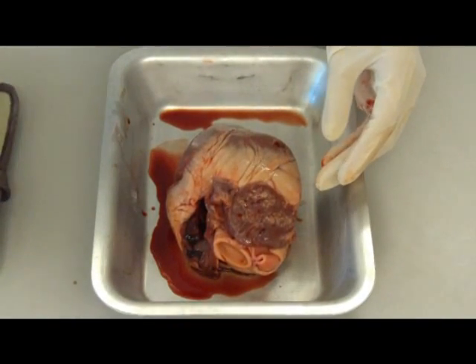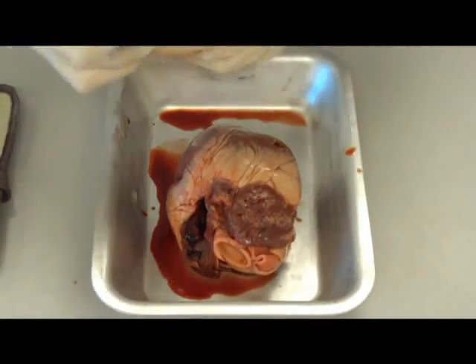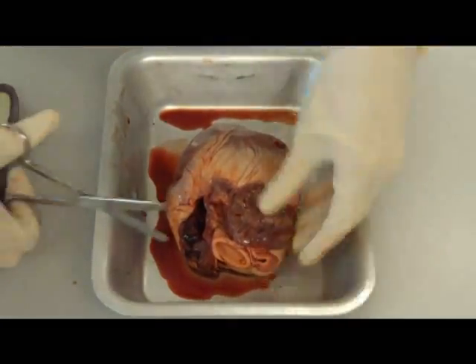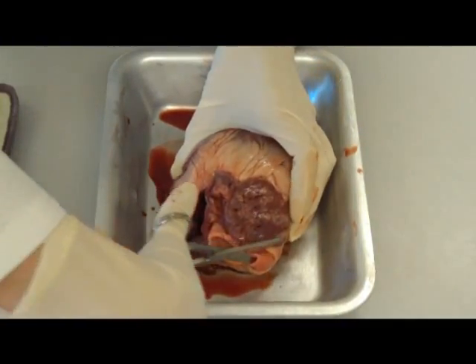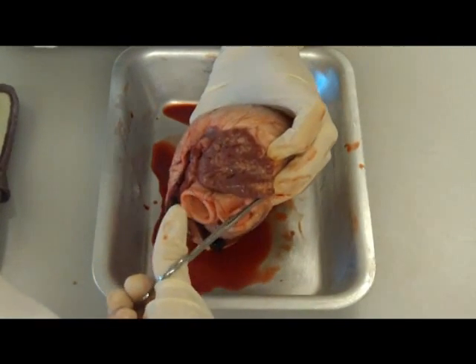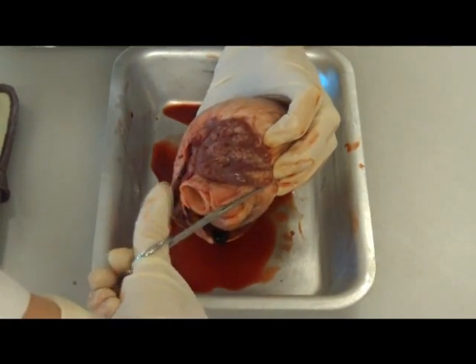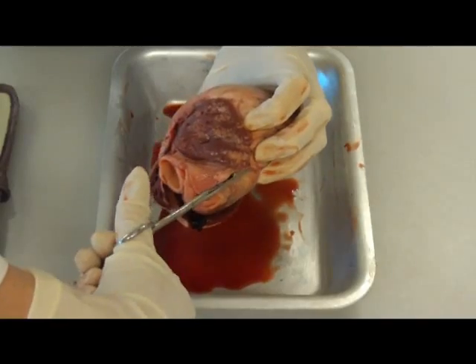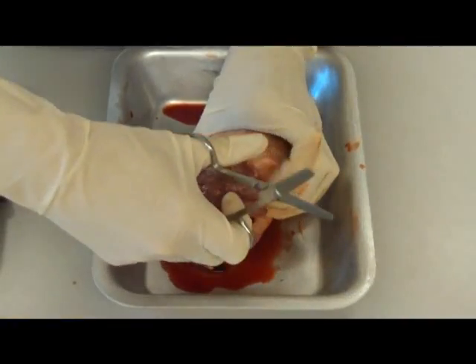So we're actually going to take some scissors and actually cut into one of the blood vessels at the top here. So we'll make an incision down there. It's quite tough because it's a muscular organ. Notice it's got cardiac muscle in it.